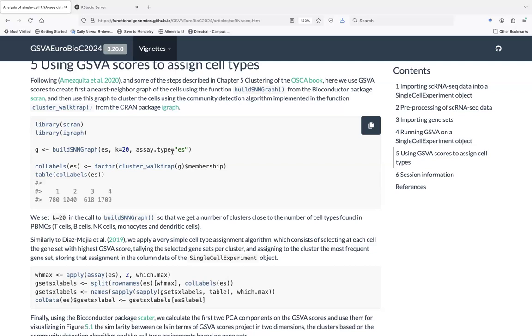The steps that it's doing, so it's doing 2 steps. One is a step in which you attempt to bring all the genes to a common scale of expression, and then you go on the columns to do the rankings, to do the enrichment per column, okay? Most algorithms don't do this first step. Many algorithms do the second step in different ways. You can do it in a competitive way with Kolmogorov-Smirnov competitive random walks.